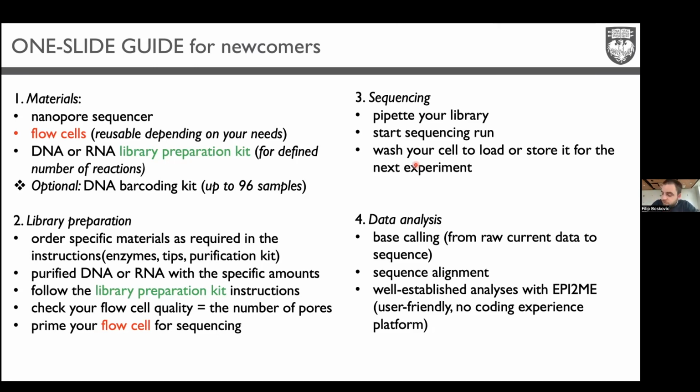Usually we throw it way earlier, like when you reach like 100 pores, you will need to measure for a long time to get something. But for these facilities, they really know how to maximize that. And then you do data analysis.